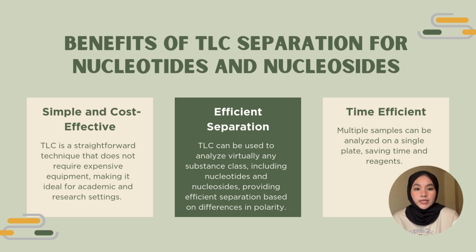The second benefit is efficient separation. Silica gel is an excellent stationary phase, providing effective separation of nucleotides and nucleosides. These compounds differ in their polarity, and TLC takes advantage of these differences to separate them efficiently.